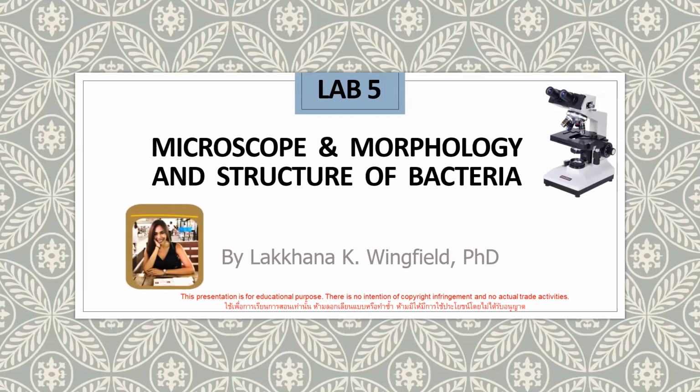Before we move on to the practical, I would like to tell you the objectives of this practical. First, you should be able to describe the components of the microscope and use the microscope correctly. Second, you should be able to prepare bacteria for microscopic viewing with emphasis on different types of staining, especially Gram staining. Third, you should be able to use a microscope to study morphology, Gram staining, and other structures of the bacteria. And fourth, you should be able to describe the colony of the bacteria on the agar plate.